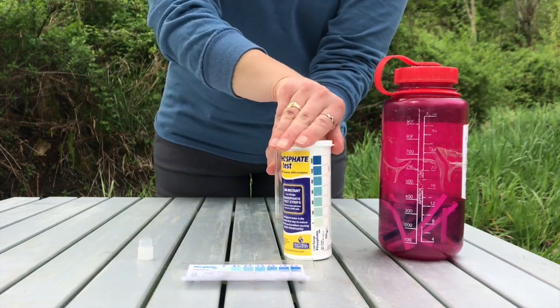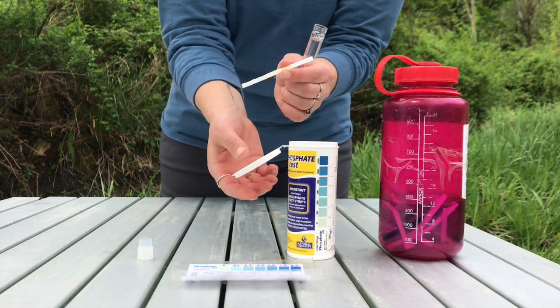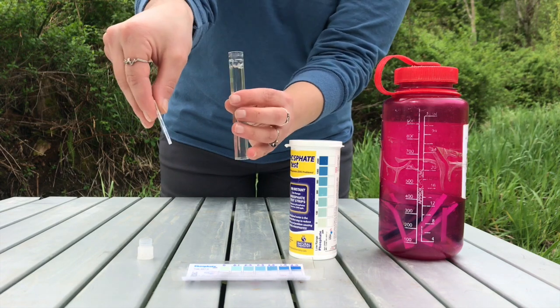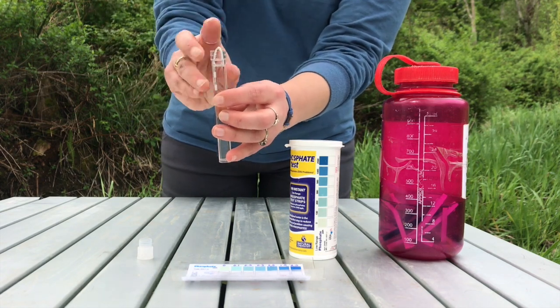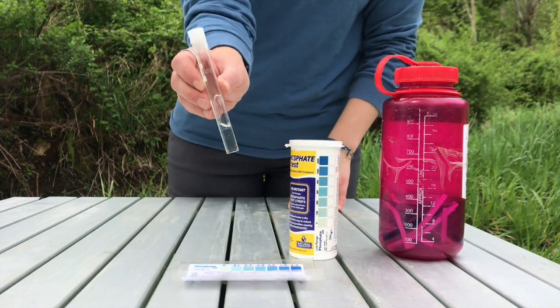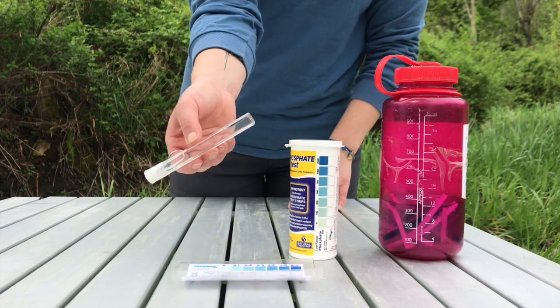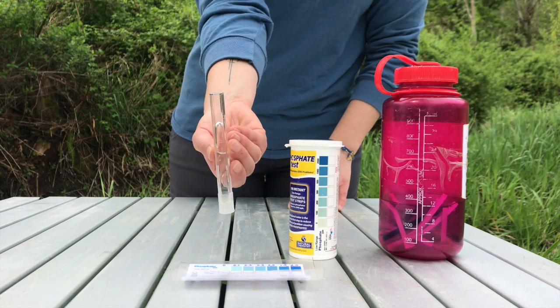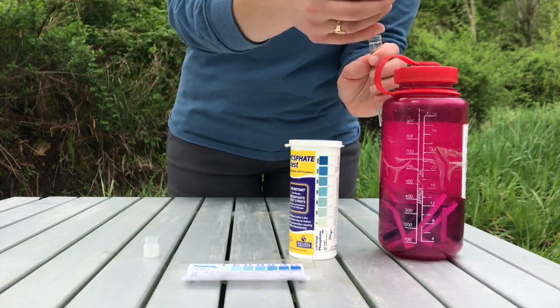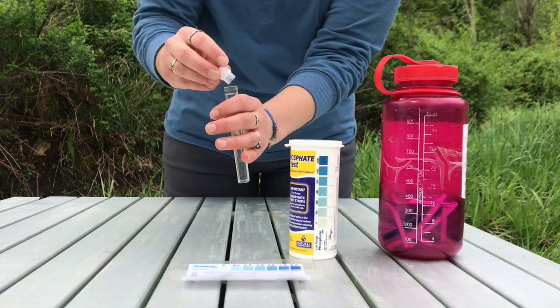To begin, we first need to place a test strip into the vial containing our sample from Jones Creek. Next, we need to cap the vial and invert it 5 times. This ensures adequate mixing and provides enough time for the reaction to occur. Next, we remove the test strip and be sure to dispose of it in a waste container. Now, we're ready to take our reading.